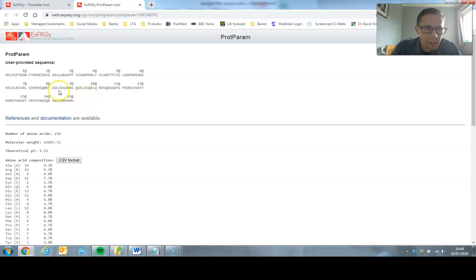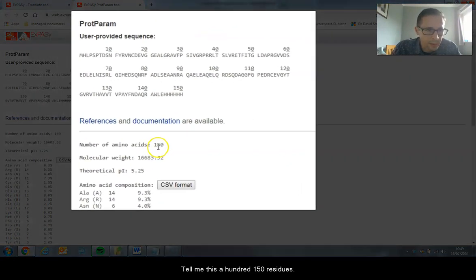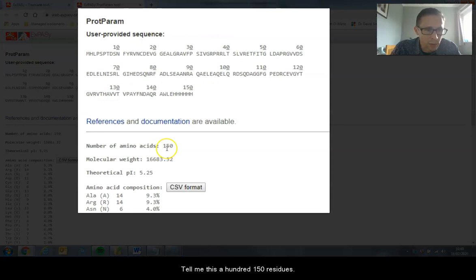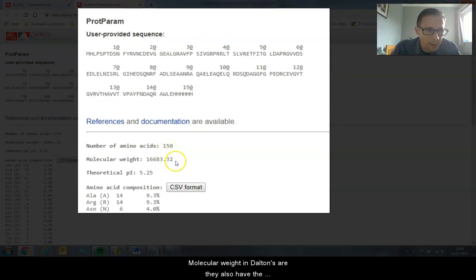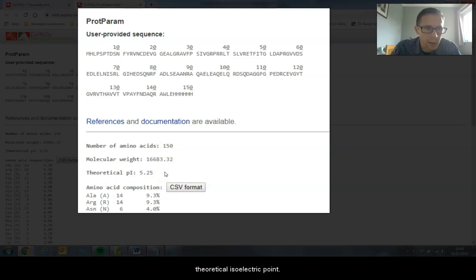Here is the amino acid code for our protein. It's told me there's 150 of them. I have the molecular weight in Daltons and I also have the theoretical isoelectric point.